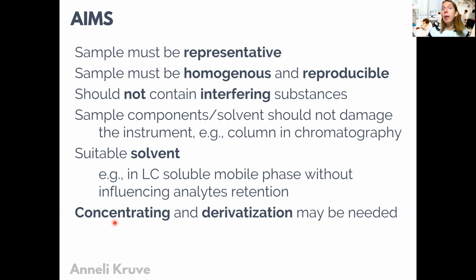And in the next part, we are going to look through the analysis of gases, liquids, and solids, because the methods actually strongly depend on the physical form of the sample that we have in our analysis.